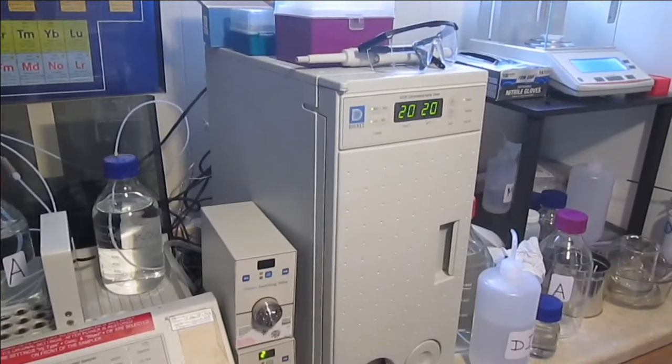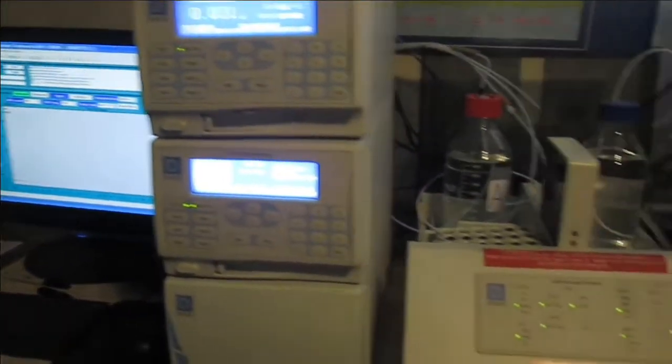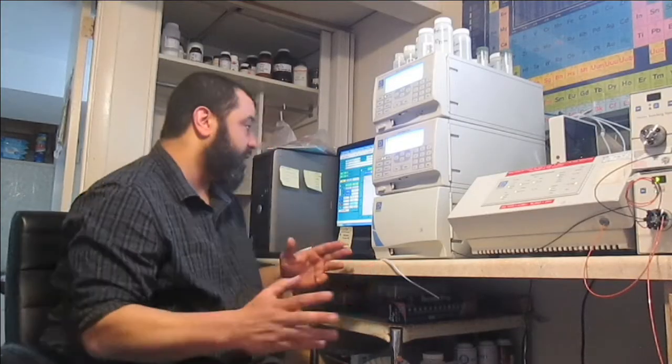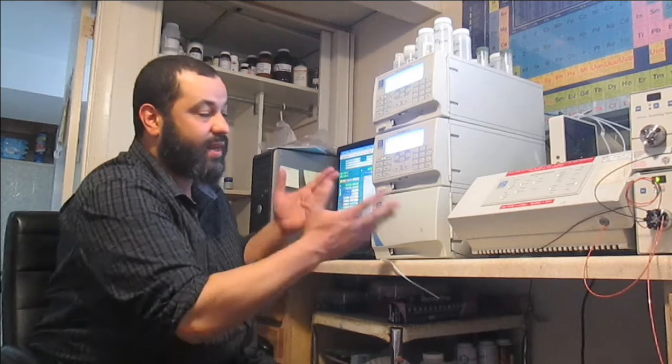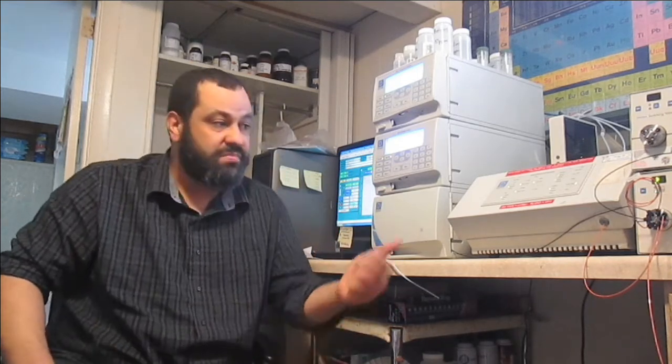Although it uses the same technology, the ion chromatograph takes it a step further as both a qualitative and quantitative analytical instrument. All right, so everything has been programmed and it's all ready to go. The computer is handling everything. There's nothing else for me to do, so I can just go out and do something else and review the data when I come back.